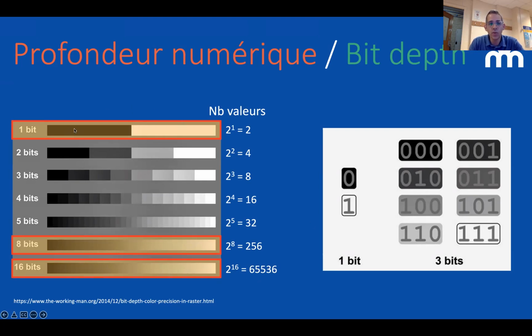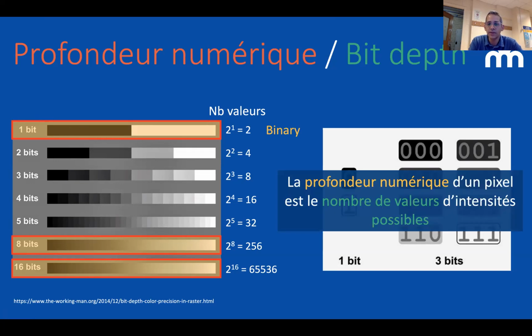But we also use the 1-bit because it's very convenient if you want to say yes or no in one image. We don't acquire images with 1-bit, but we use it in the processing. This is called a binary image because we have only black and white. The take-home message from this is that an image is a matrix of points, and there is a bit depth that encodes the number of levels you can have in your pixel value.